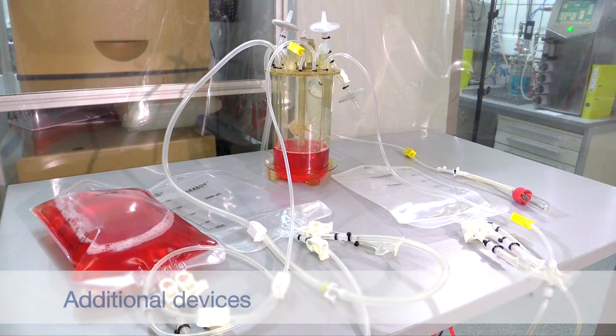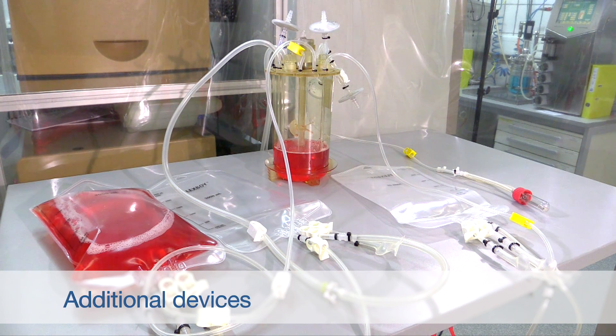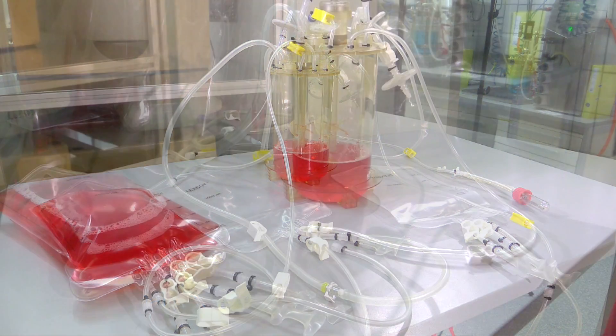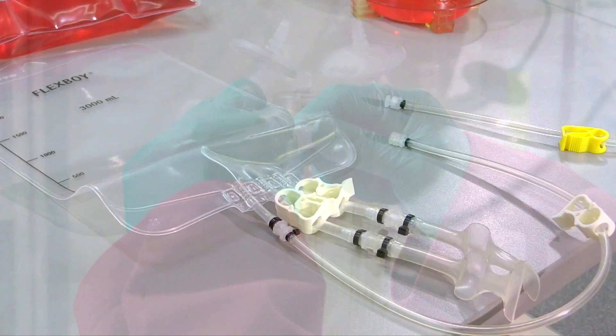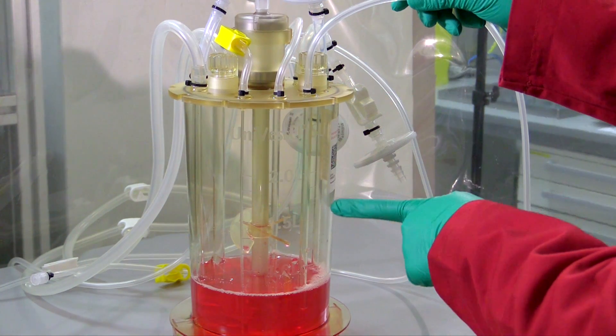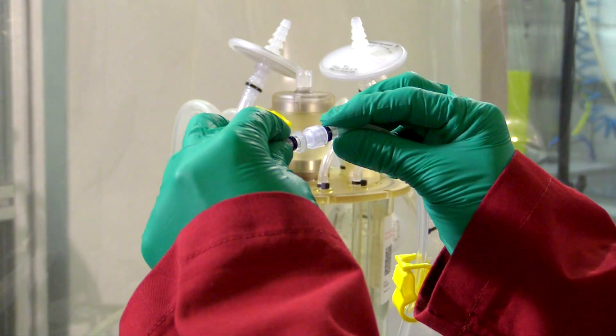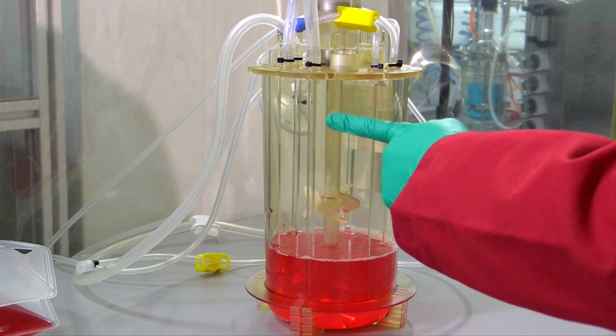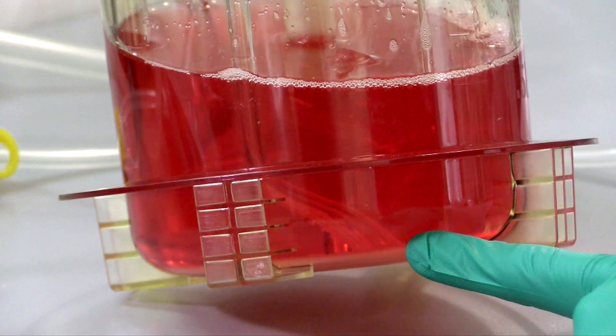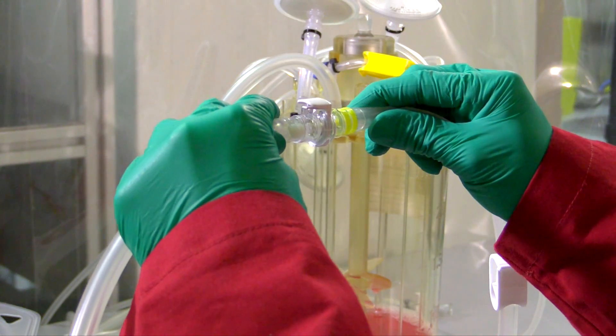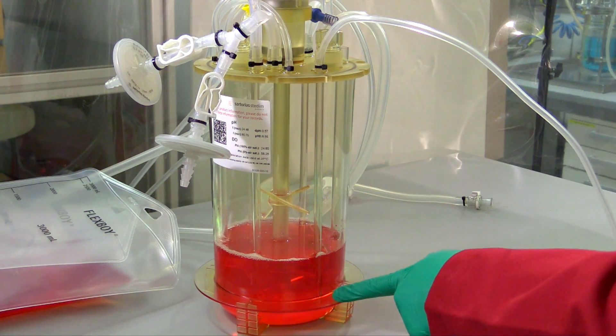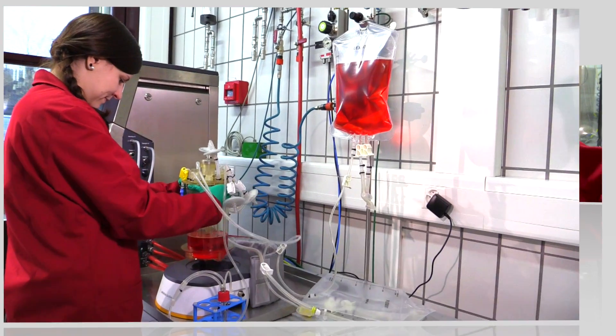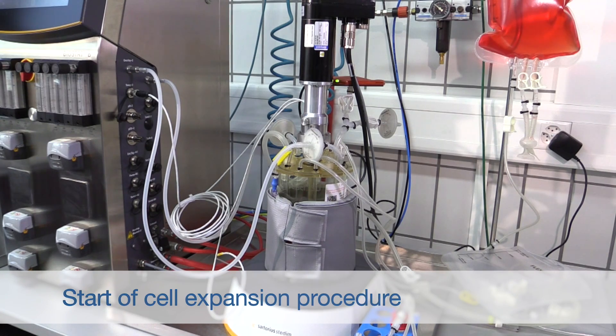Before linking the bioreactor with the control unit, several important additional devices need to be connected to the bioreactor. These are the medium bag with 2 liters cell culture medium, the waste bag, the harvest bag, and the external sampling device. The bioreactor is then placed in the universal holder next to the control unit and connected to it.